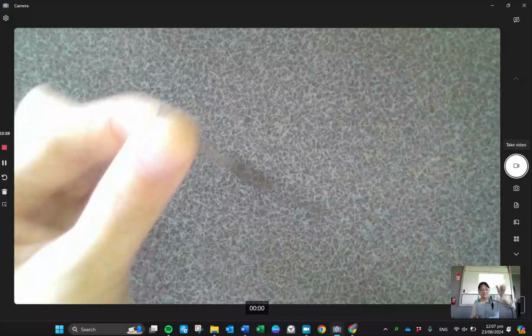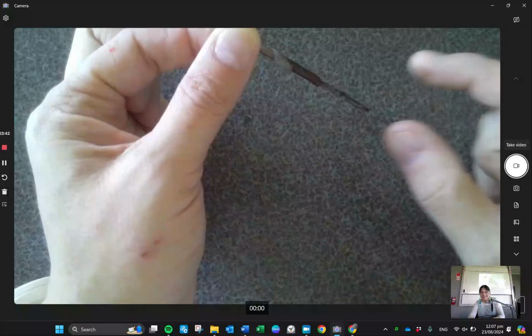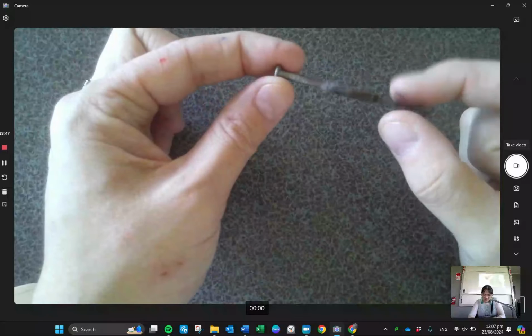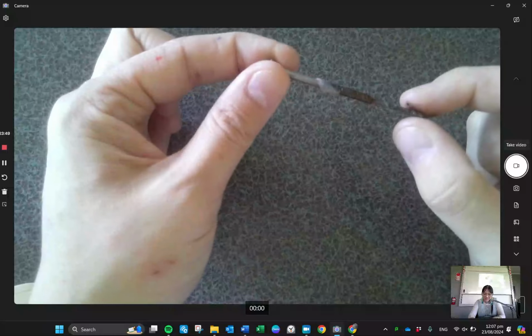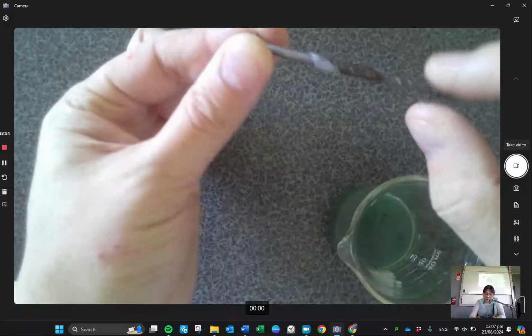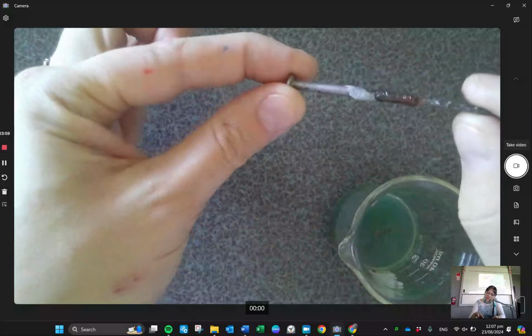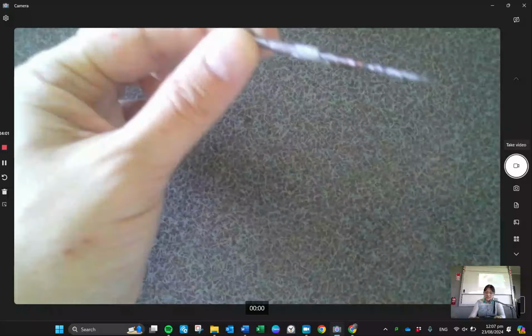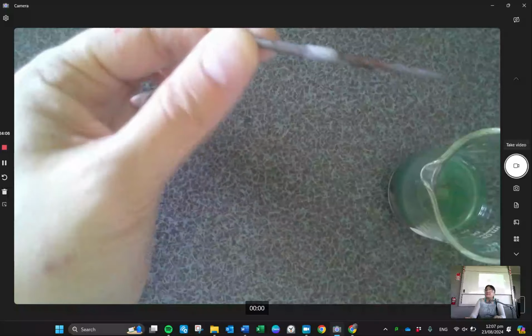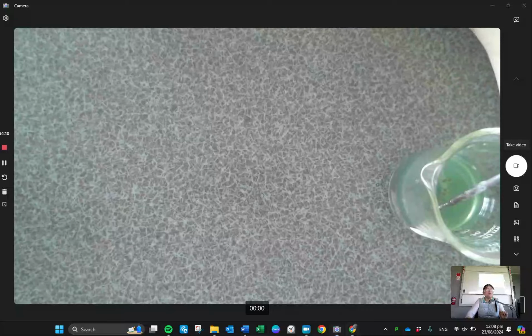Oh, you can't see there. Hold on. It's lost. So we're not going to keep these nails because I don't think that's worth keeping. So we'll just chuck these out too. But isn't that cool? It's so small. That's why I only want you to dip half the nail in there, so you can see how much actually reacted away. So remember, it's not dissolving. It has displaced it with copper. So now we made copper. Do wash your hands if you just touched it like I did, because you don't want that copper sulfate. All right, cool? All right, let's do some more.